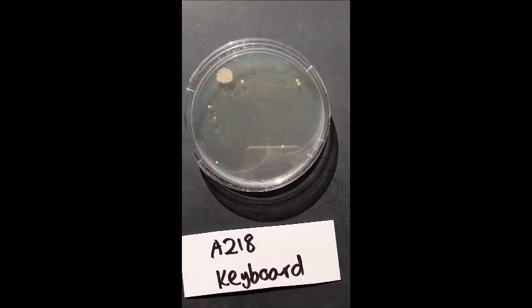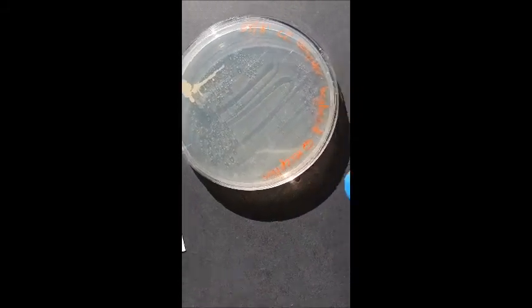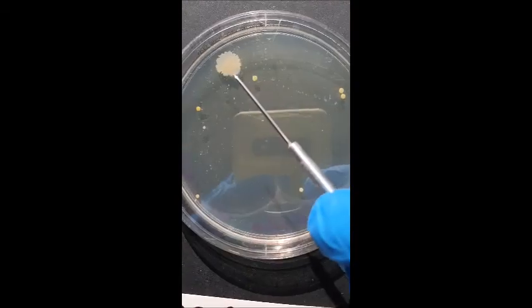Oh, I wanted to show you. I took a swab from the keyboard in reception for another class, and that was the result of that. It looks like that could be a similar kind of bacteria to this one.